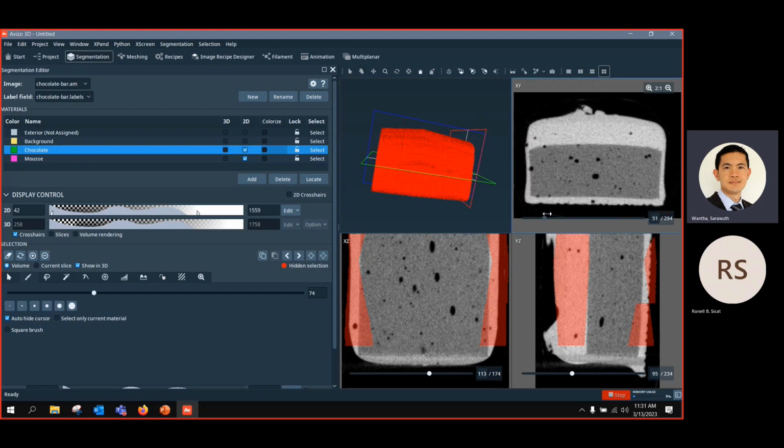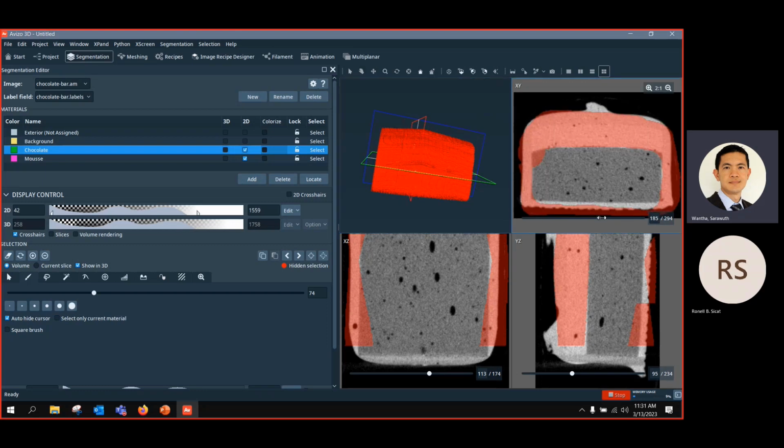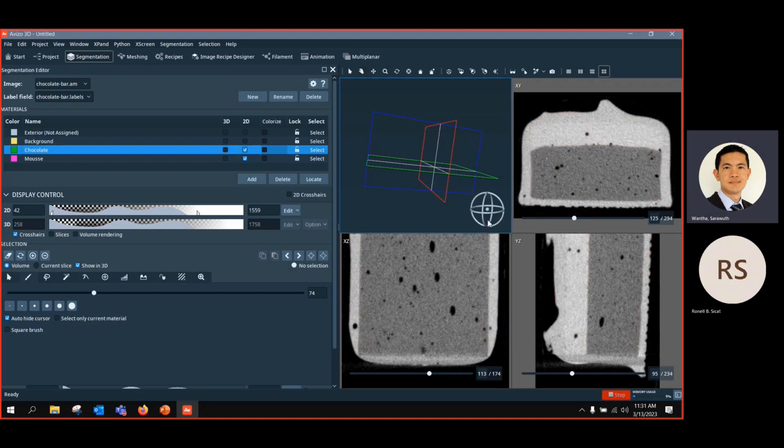And I think it's not really good to use this brush tool and interpolate them. You can do it, but it is not very accurate either. So you can clear them. Also, you can maybe create some fake shape if you want to try something. For example, I can show you quickly. Maybe it's not really useful, but just to give you an idea.